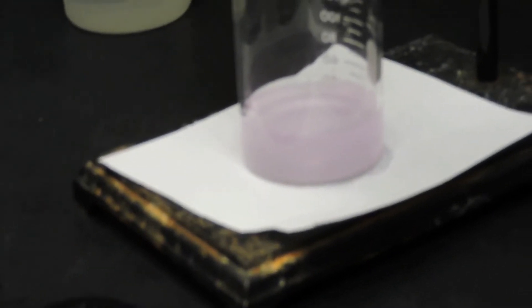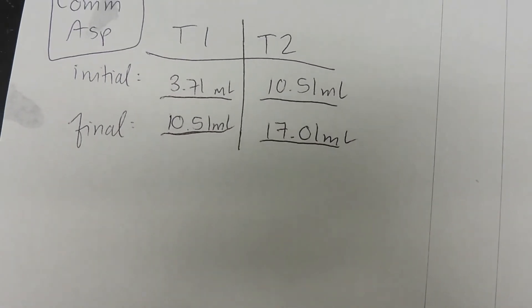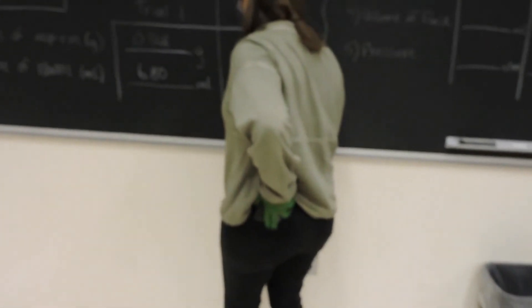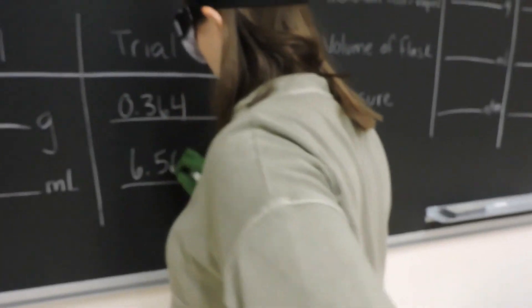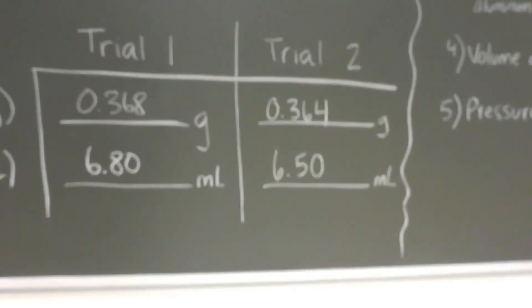The titration is complete, evident by the light pink color of the solution. The final volume of the burette is 17.01 milliliters. The difference between the two gives us our total volume of NaOH used, which is 6.5 milliliters.